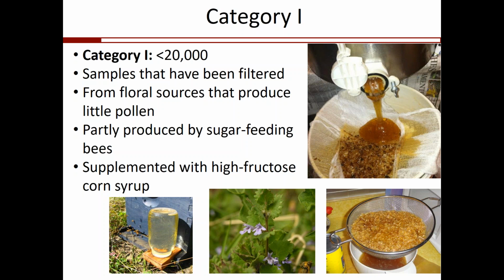And he wrote an article about that, and a lot of that can be because the wax pieces or bee parts will end up getting clogged, and the honey and the pollen will get caught along with that. This is a very extreme case of your filter getting clogged, but even when it's relatively free-flowing, the pollen will easily catch on to the sieve itself. So any type of filtering will actually affect the pollen concentration value of your honey.